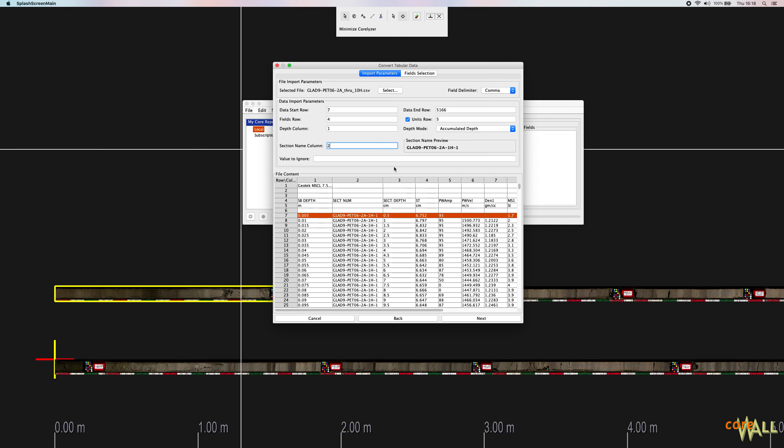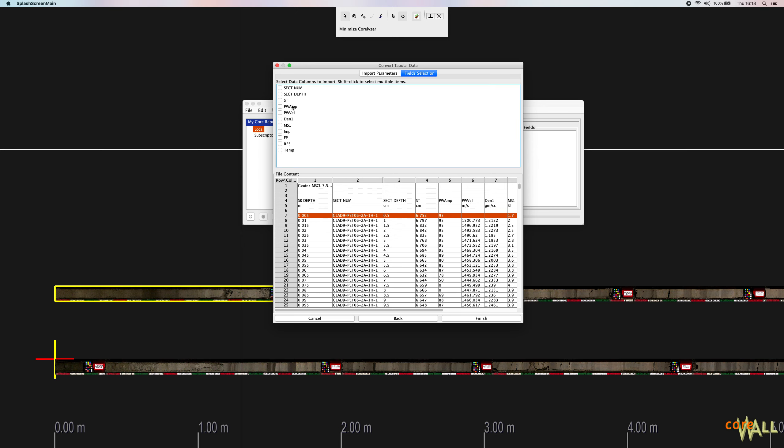And then finally, this field is not typically used, but if you have a placeholder value like 9999 or bogus that indicates an invalid value, you can enter it here. But in most cases, this field can be left blank. So once your data import parameters look correct, you can click the next button, or you can just click the field selection tab. They both take you to the same place, the field selection area.